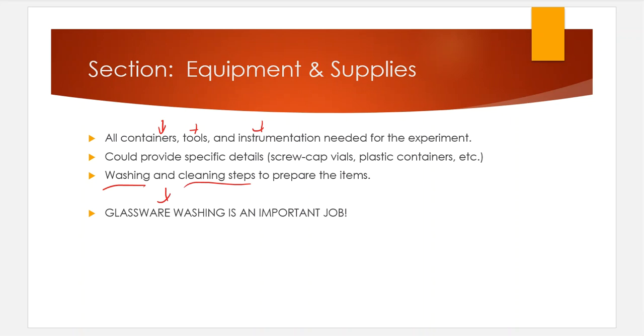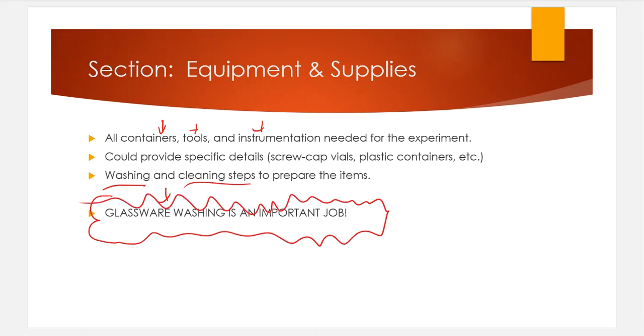So glassware washing is a very important job. I can't stress that enough. A lot of people think that if they're assigned to wash glassware in a laboratory, it's like the worst of the jobs, but it is not. It's the most important job in a laboratory because everything has to be cleaned, everything has to be sanitized, everything has to be ensured that it brings no contamination to the table. So glassware washers are the most important role for that.